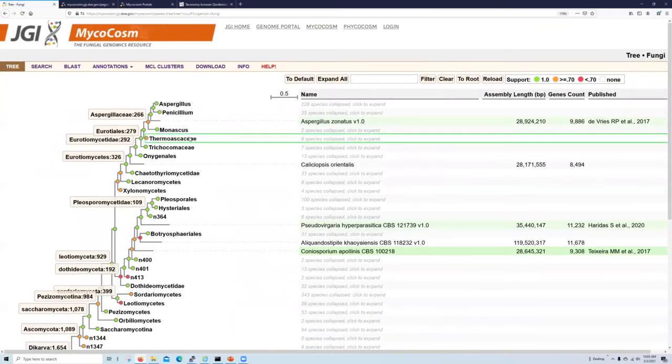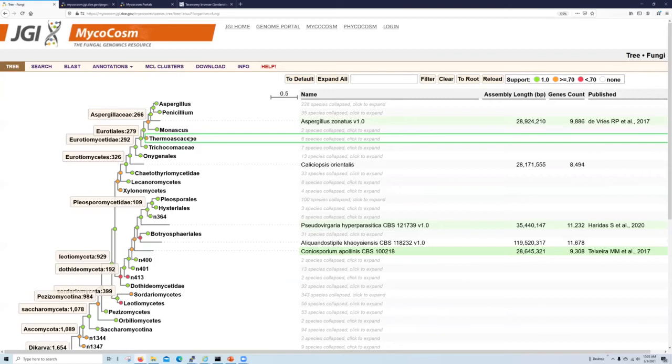So the tree tool provides a searchable and interactive phylogenetic tree for exploring the evolutionary relationships between members of the group. Each phylogroup is a maximum likelihood phylogeny based off orthologous proteins determined through MCL clustering.